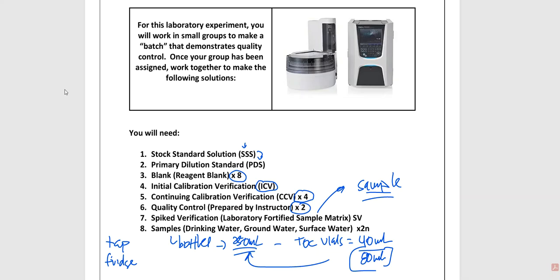We've had some people in the past that have had some filter systems on their shower heads, believe it or not. So if you want to, you can take some tap water and then catch some of the water from the shower head and see what's present. That's not a big deal. A Brita filter, some kind of filtration system that is on your faucet in your kitchen, you can do a before and after that way as well.